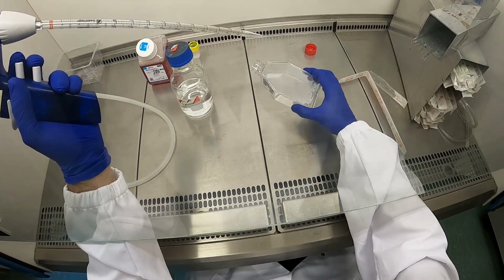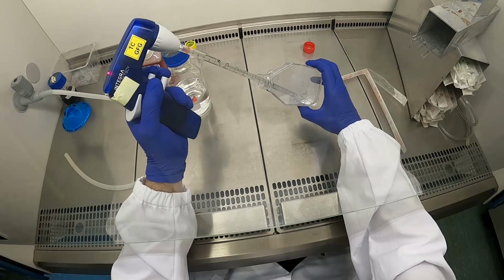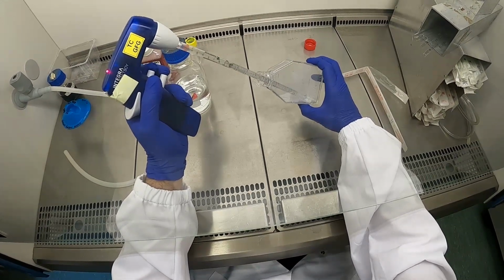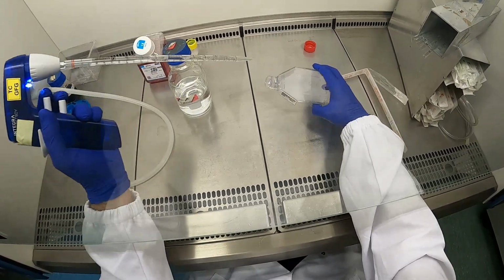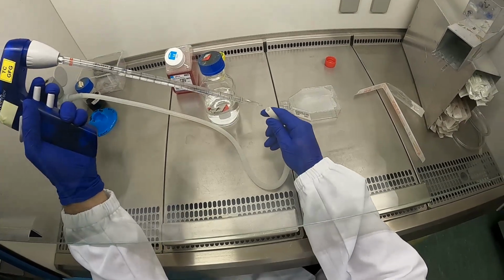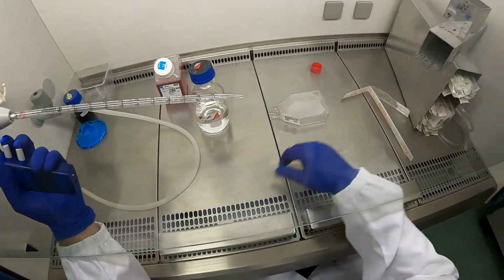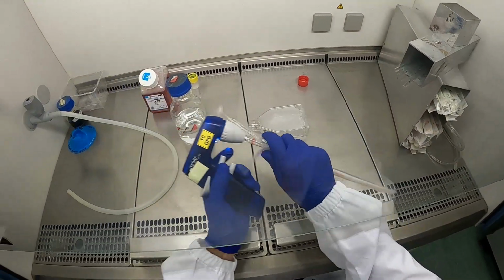Normally you avoid spraying the PBS, whatever you introduce into the flasks, directly onto the cells. You sort of hit the back of the flask and then more gently cover the surface by rocking the flask. Well done.